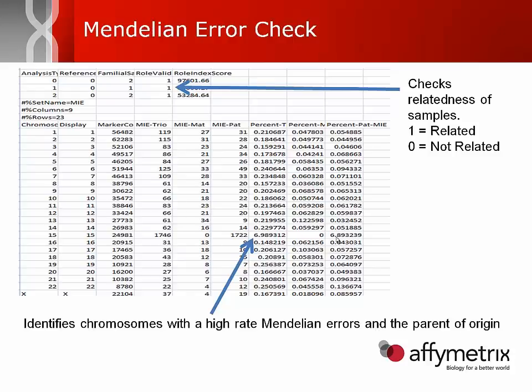So in this particular case, mom, since she has 0 errors, seems to have donated both her chromosome 15s to the child, or at least a large region of them. And so we're seeing this high error rate for chromosome 15, but none of the errors coming from mom, indicating that both chromosome 15s in the child have come from mom and not from dad.